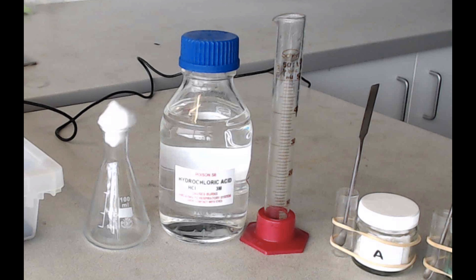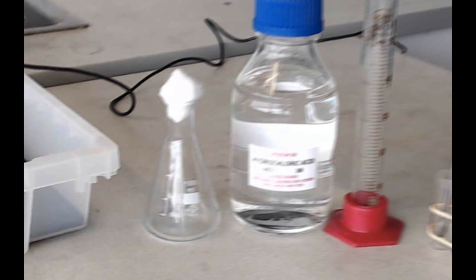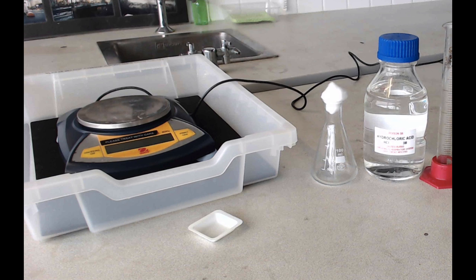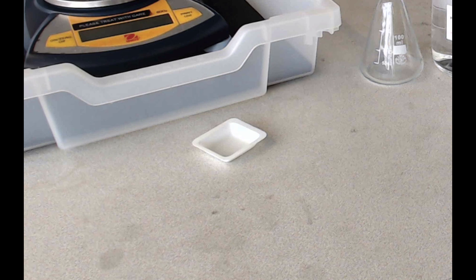You're going to need some hydrochloric acid and a 50 ml measuring cylinder to dispense that with. You're going to need a conical flask that has got a cotton wool bud in the top. You'll need a balance and a small plastic weighing boat to weigh your solids out in.